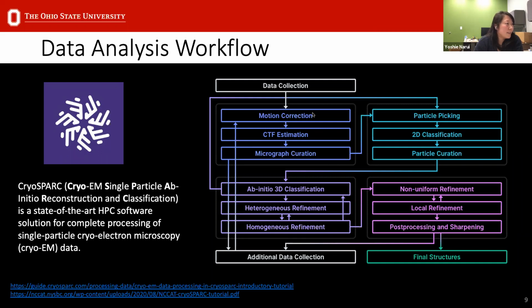Okay, somebody asked. Oh, yeah, it is good. So the data is obviously freely available to download. I believe you could just install CryoSPARC on your local machine. As long as you have a GPU available, it's fine. And we'll make this presentation available online afterwards.